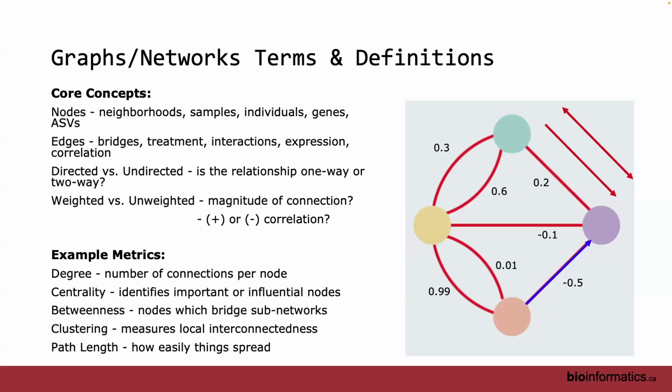And so along with being able to visualize these types of networks and start to look and explore your data, you can also calculate a number of different really interesting metrics for those networks. You can do degree, which is the number of connections per node. That was what Euler was using, which was the degree of a node. There's centrality, which talks about whether or not certain nodes are more influential in the network, or there is betweenness, which helps to bridge between multiple nodes across a community.